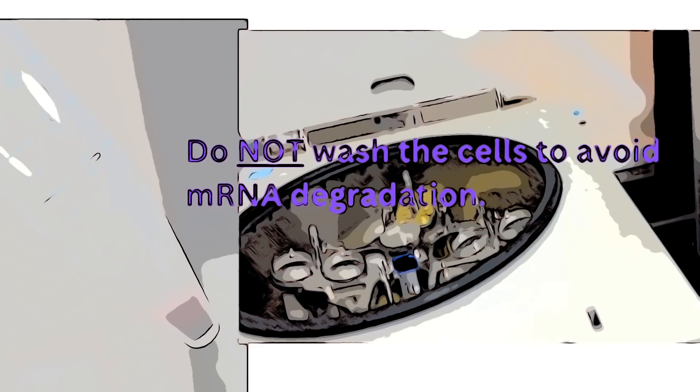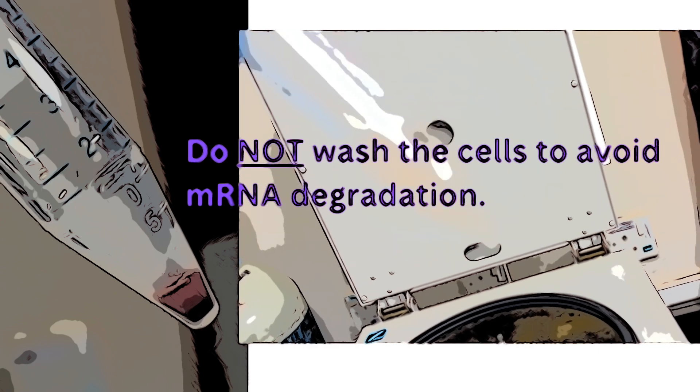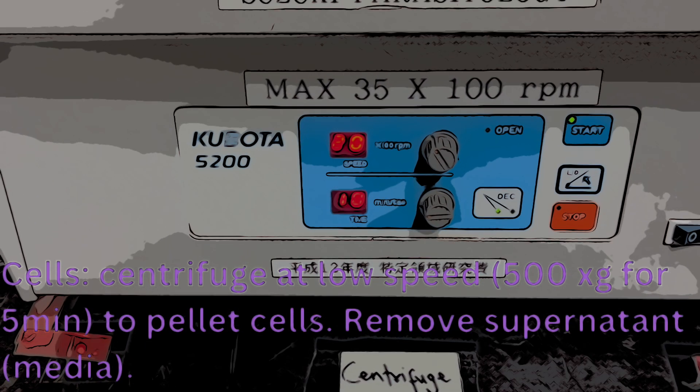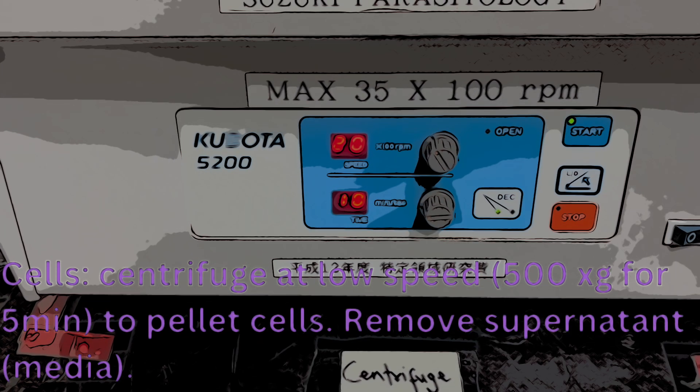Once you've harvested the cells, you want to spin them down in order to remove the cellular fraction from the media they were grown in. You can pellet at 500 × g for five minutes or more. You want to be relatively gentle — 500 × g, or probably up to 1500 × g — to gently pellet out the cells. Once pelleted, go ahead and remove the supernatant, which would just be the media and growth factors.